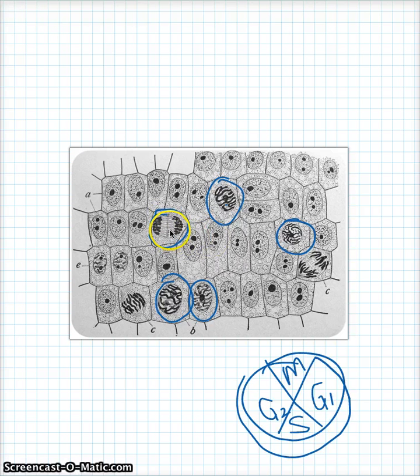Okay, here's a nice picture of anaphase. It might even be at a point where it's starting to start telophase because you can start to see this little cell plate forming. We could have an argument about that because not every single picture is cut and dry.